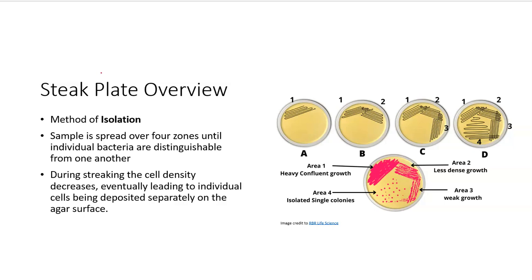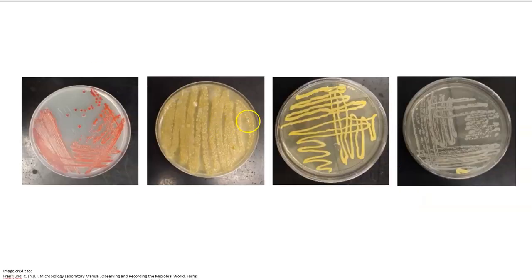So typically when we collect a sample of bacteria and inoculate it to a nutrient agar plate, if there's a high concentration of bacteria, they do tend to just grow into a large blob. To kind of show you that, it would be something like we'd expect to see here. And the problem with something like this is there could be unknown contamination hiding within the bacterial growth that we're trying to generate, which could obviously affect our test results.